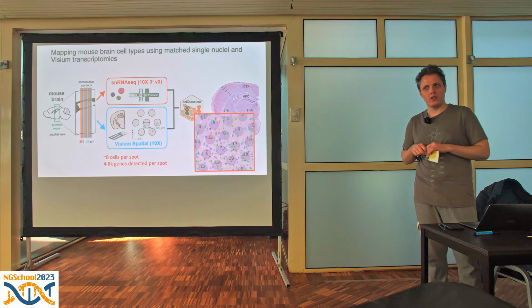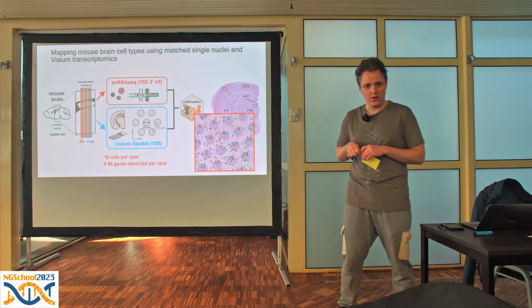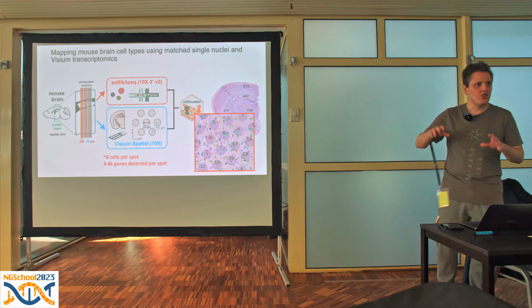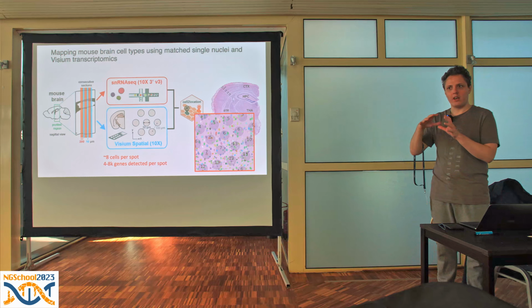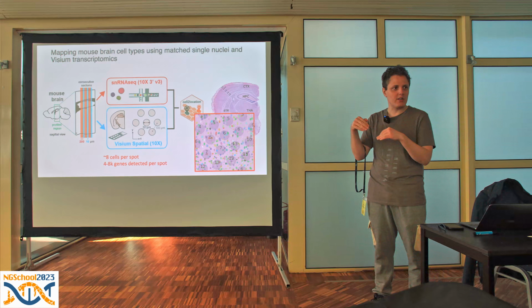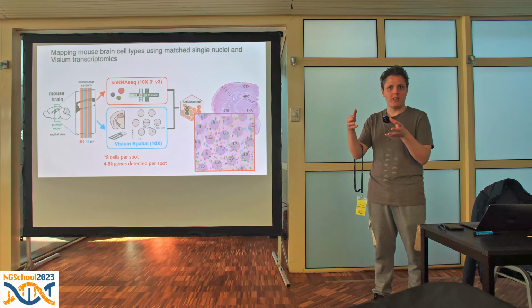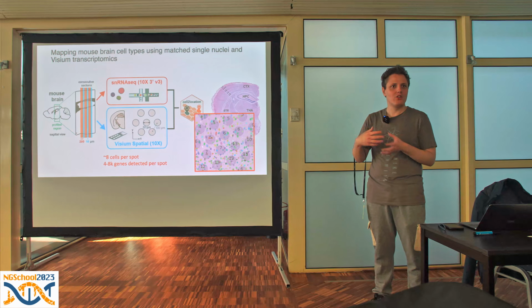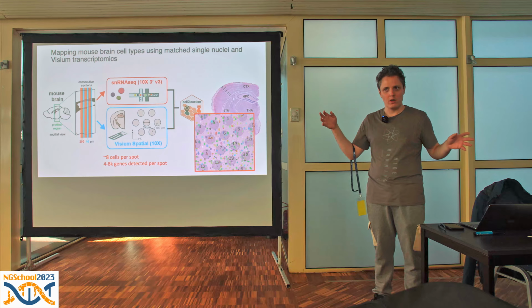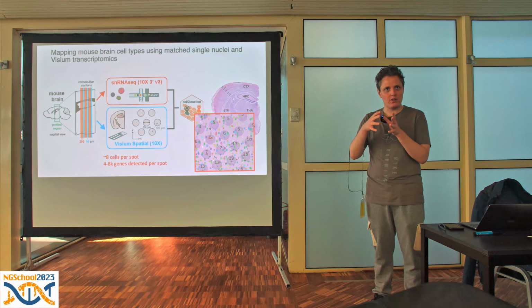And one of the concerns with FFPE methods, so for example, the newly released CytAssist technology, which to some extent works beautifully, is that the technology works by hybridizing oligonucleotides to RNA rather than detecting RNA directly. And because you hybridize detection oligonucleotides, you have to design them. I guess they have done reasonably good work designing those oligonucleotides, but you can't cover all. You already bias your set to certain gene models.